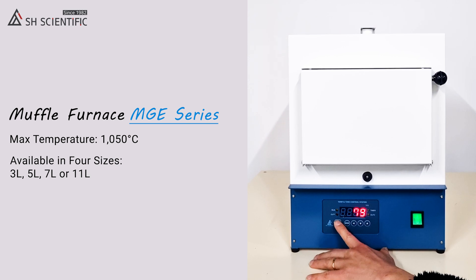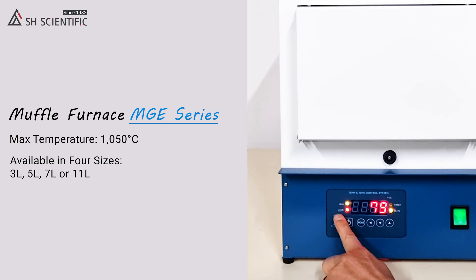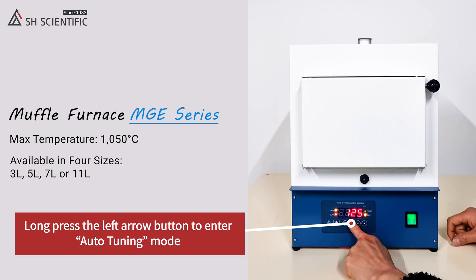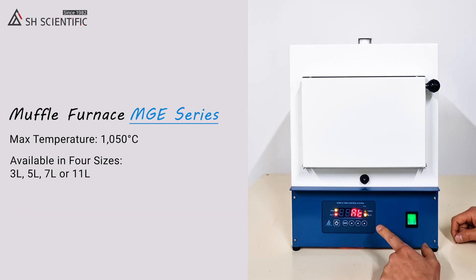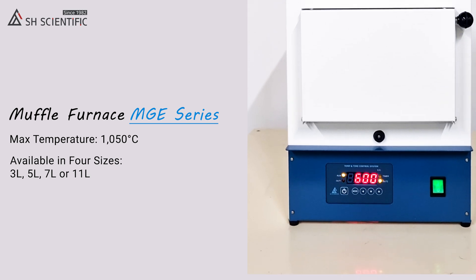When you're satisfied with the temperature and time settings, press the Power button. You'll see that Run, Out 1, and Out 2 are all illuminated. All of our furnaces have a neat troubleshooting feature called Auto-Tuning. It uses PID controls to automatically optimize the output of the heater and keep it from overshooting your target temperature. You can run Auto-Tuning either while or before running the furnace. Look how quickly it gets to the set temperature — we're just 12 minutes in and it's already 600 degrees Celsius.